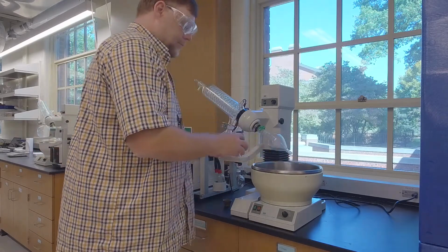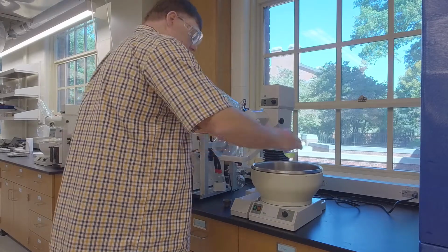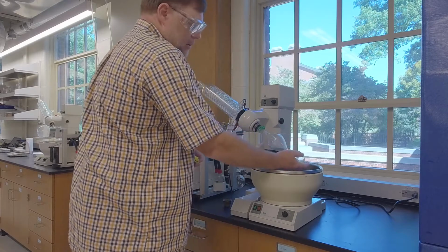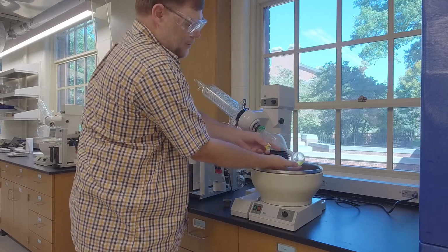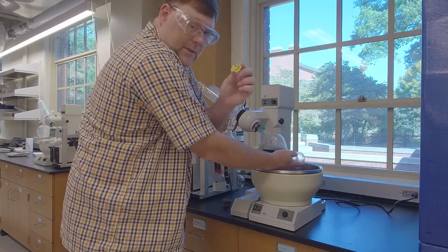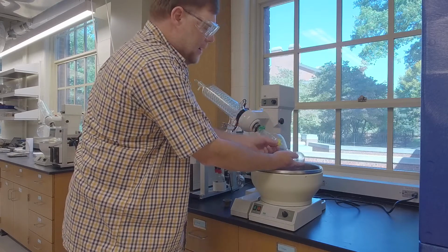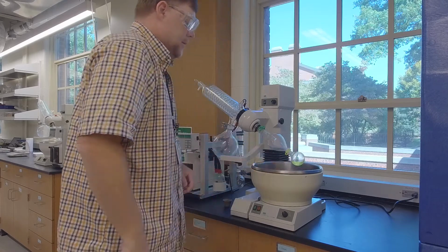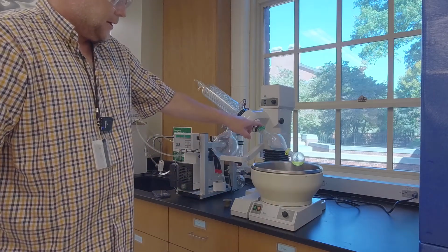So, all right, you just slide these two ends together. Now, if I let go, the round bottom is going to fall into the water. So I'm going to use this yellow keck clip, the fat end on the bottom, the thin end on the top. That holds it in place. You see a larger green keck clip there.